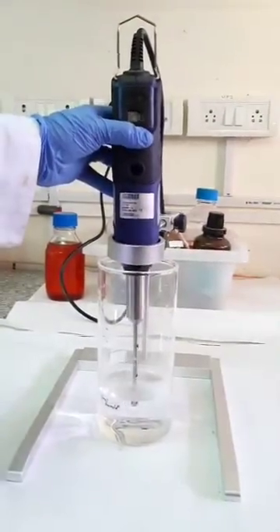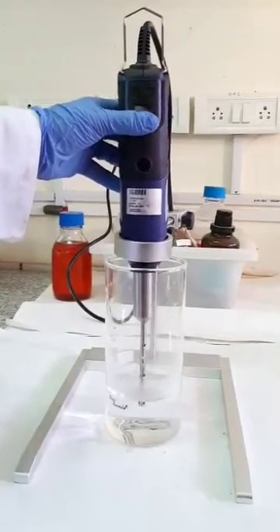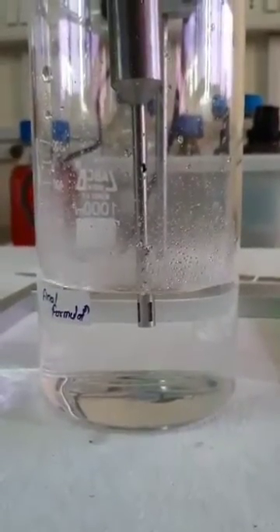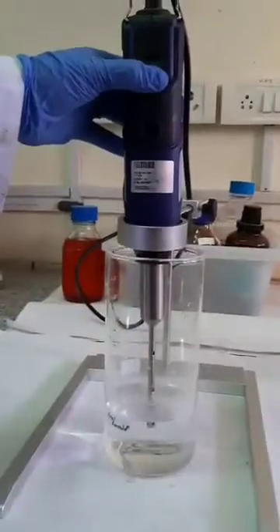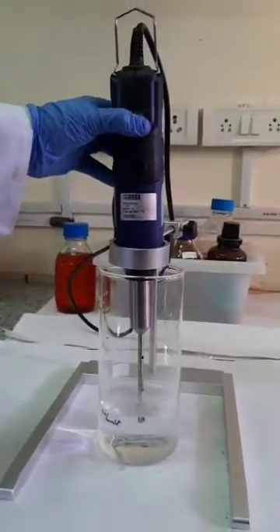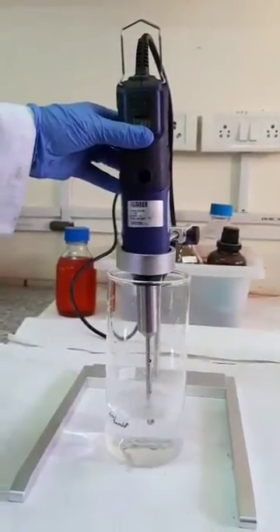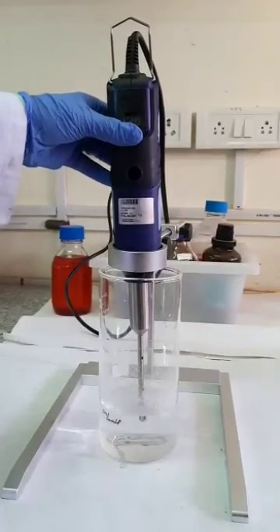To reduce the particle size of my final formulation, I homogenize it for about 20 minutes at 20,000 rpm in the homogenizer. After that, my final formulation is ready — this is the itraconazole-loaded SMEDDS.